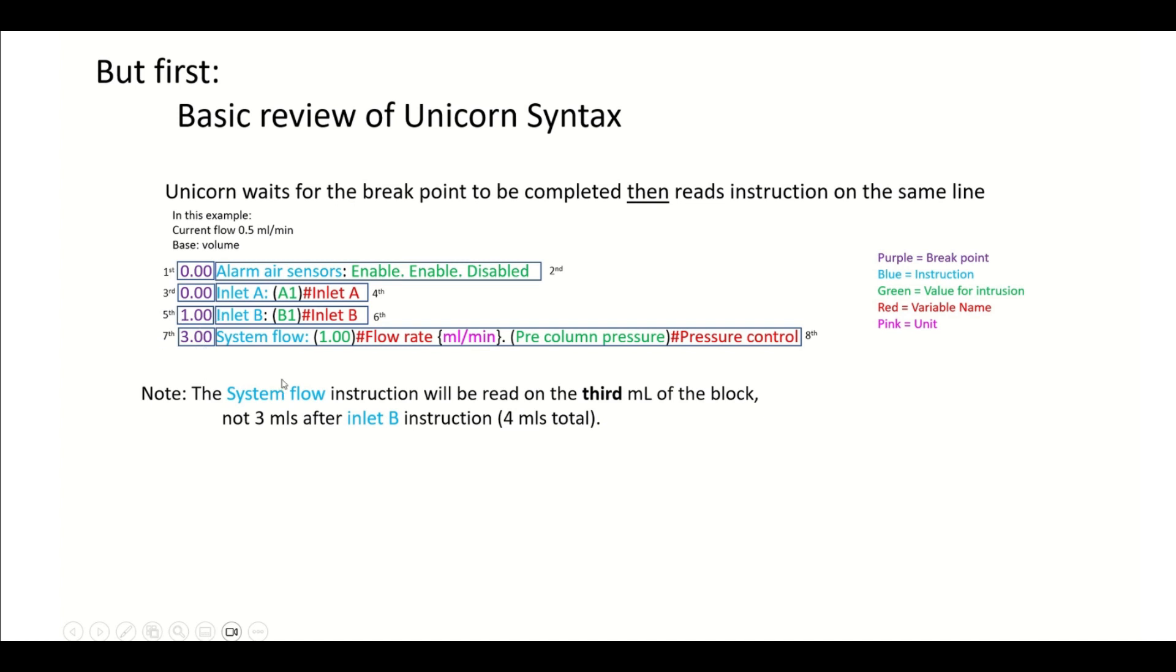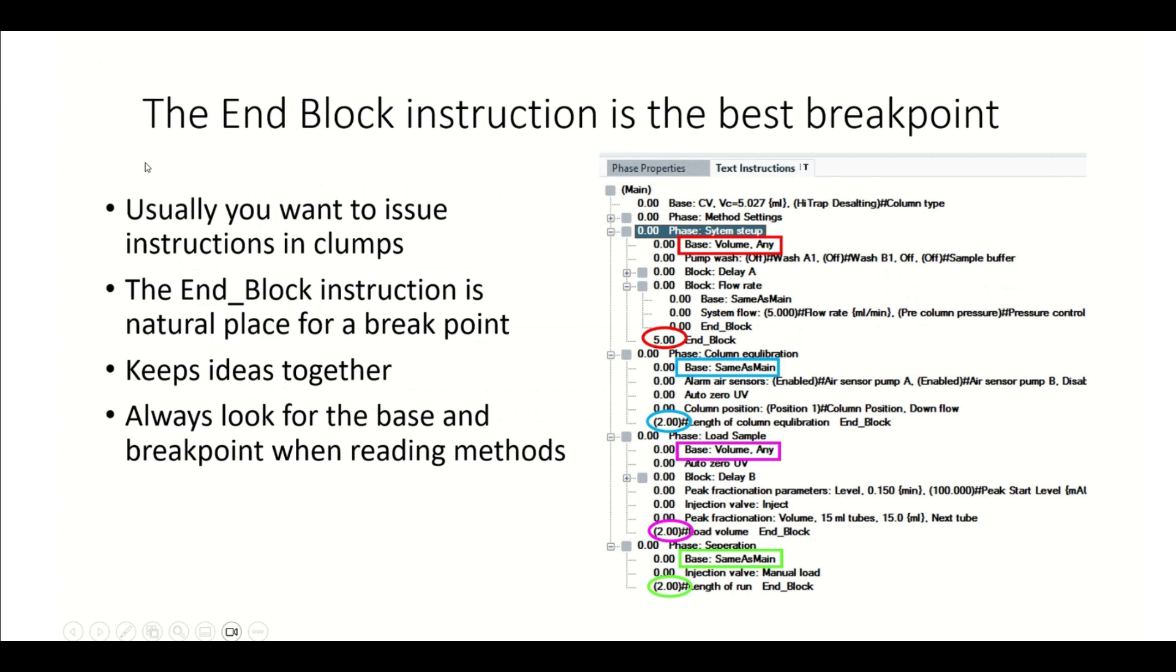Now that we understand that about the unicorn syntax, I want to tell you that the nBlock instruction really is the best breakpoint instruction to use. That's because usually we want to issue instructions in unicorn in a series of clumps, and we do that because it basically just keeps ideas together. nBlock instruction is the natural place to put a breakpoint. If we look at this load sample phase, if the volume is any, we have basically two, because we've got the delay there, three, four, five instructions. They're all going to kind of happen together. That's because we're getting ready to load the sample beyond that delay. We kind of always want to look for these instructions, like the base and the nBlock, try to focus on these things as we narrow down on the method and try to figure out what's going on inside of it.